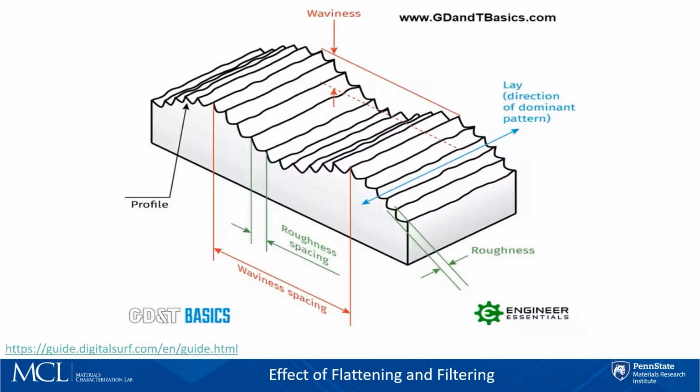To break down post-processing of our data, we want to just review really quick here what we're talking about. So we have our different components to our sample here that make up the full surface texture. So essentially we have the low frequency waviness, we have the high frequency surface roughness, we have potentially lay directions and all of that kind of stuff. So we're going to take that and now we're going to talk about our surface processing.